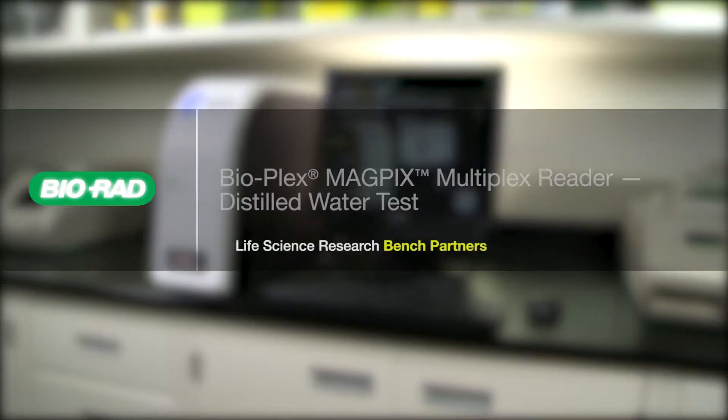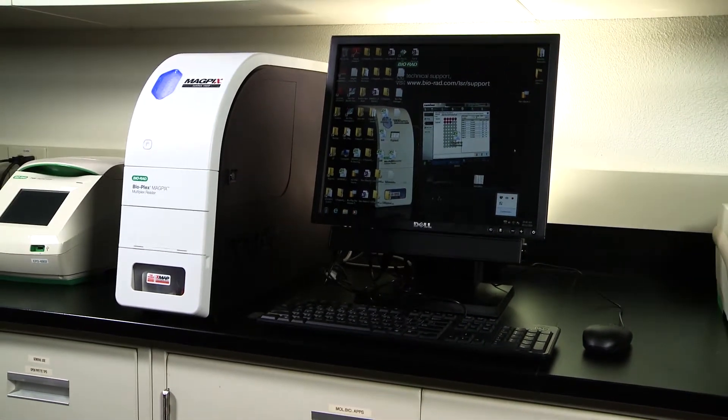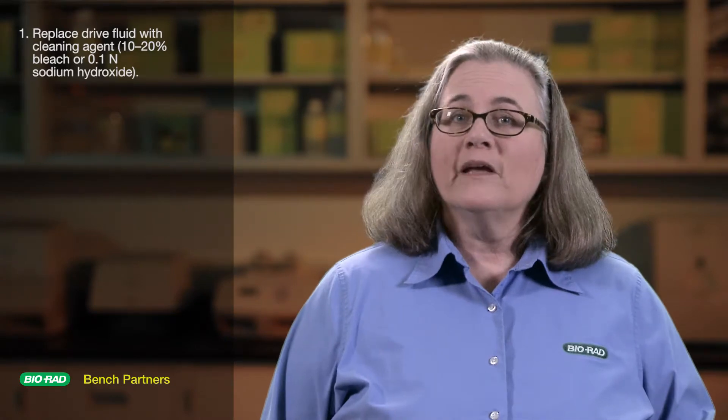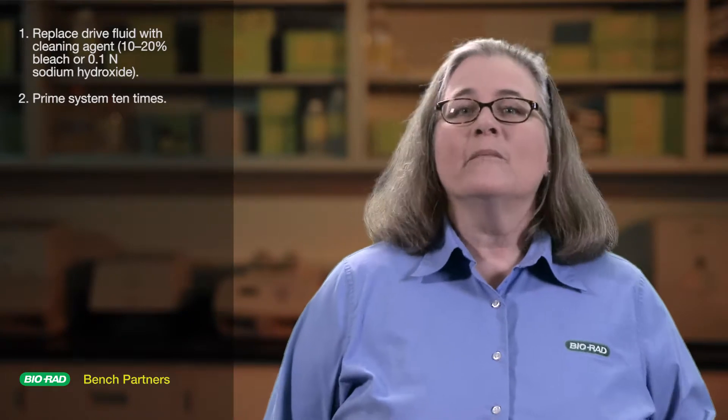Then perform the DI water test to see if the chamber is clean. Details about this test can be found in the BioPlex MAGPIX multiplex reader distilled water test video available on the BioRad Life Sciences YouTube channel. If the chamber is still clogged with beads after you've carried out these steps, an extended cleaning might be necessary. This will involve replacing the drive fluid with a cleaning agent such as 10 to 20% bleach or 0.1 normal sodium hydroxide and priming the system 10 times.